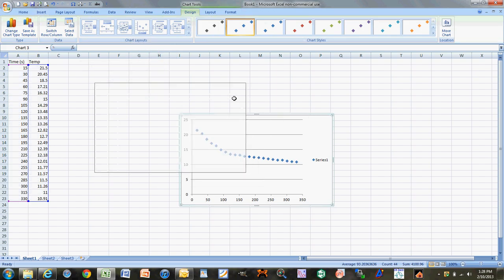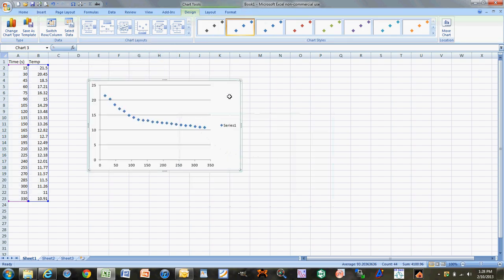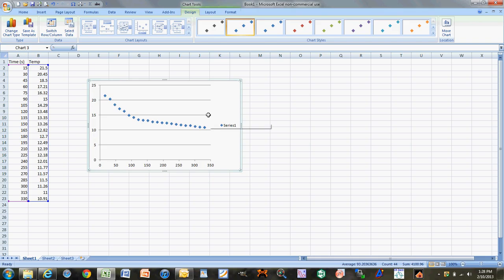Go up to Insert and create a scatter plot. You should get a scatter plot that looks like this. Notice that, unlike what you'd expect from lecture, the graph doesn't plateau out flat — this line continues going down.